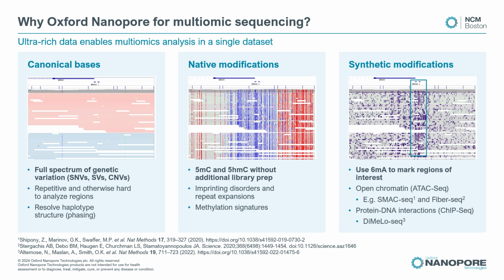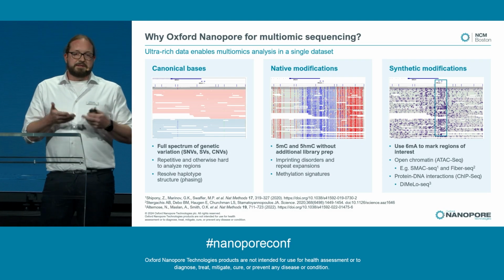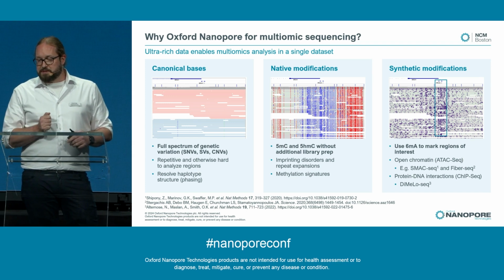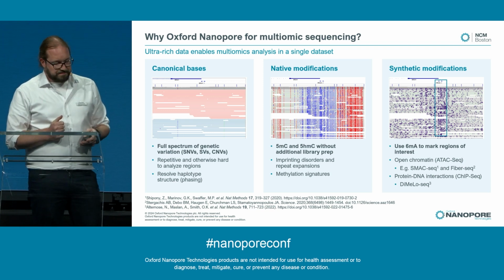which do that. The screenshot that I'm showing you here gives you one example. Very naively speaking, from a bioinformatician, you introduce a methyltransferase into the nuclei, and all the regions that are accessible will be methylated by that methyltransferase, whereas the ones that are protected won't. And that's the signal that we read out. So that's what you see on this screenshot, where all the regions that are purplish indicate that there's open chromatin there.